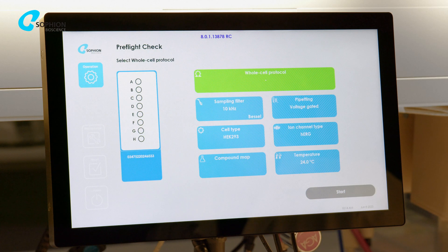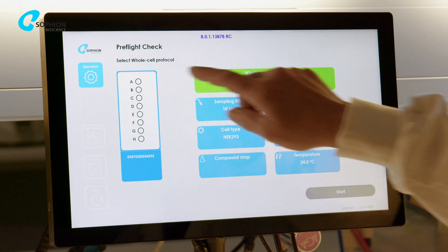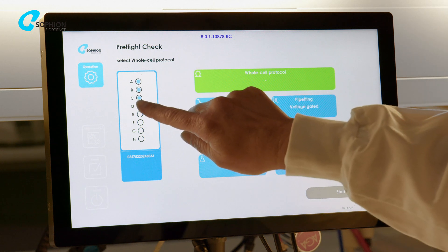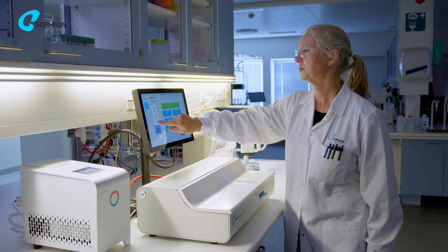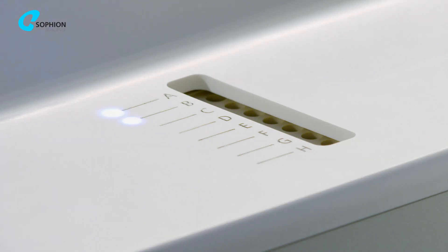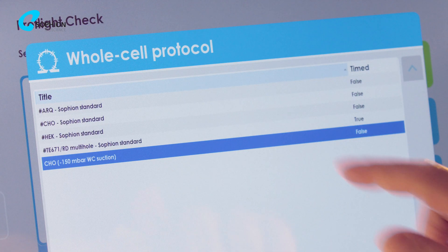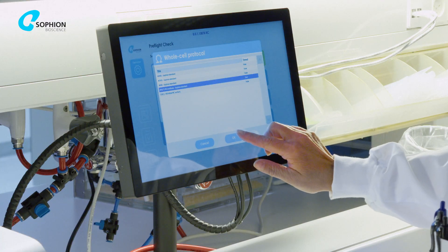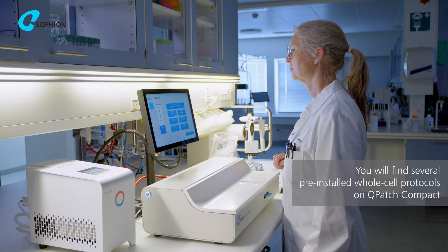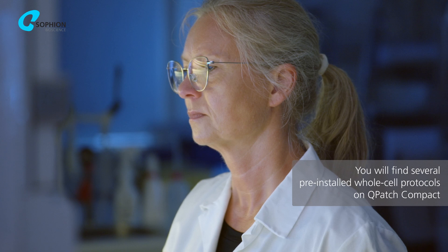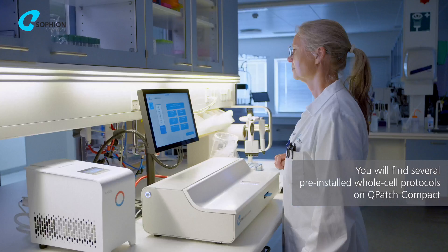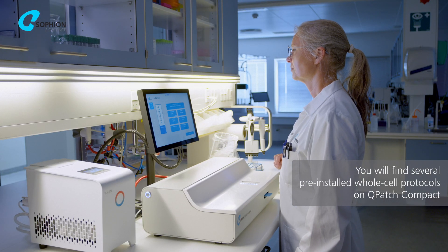From the Q-Plate pictogram, select the sites from A to H in which you want to conduct your experiment. The light guidance indicates the corresponding active sites. Select the desired whole-cell protocol with which you want to run your experiment. There are a series of standard protocols supplied with your instrument, or you can customize your protocol using the Sofian analyzer software.